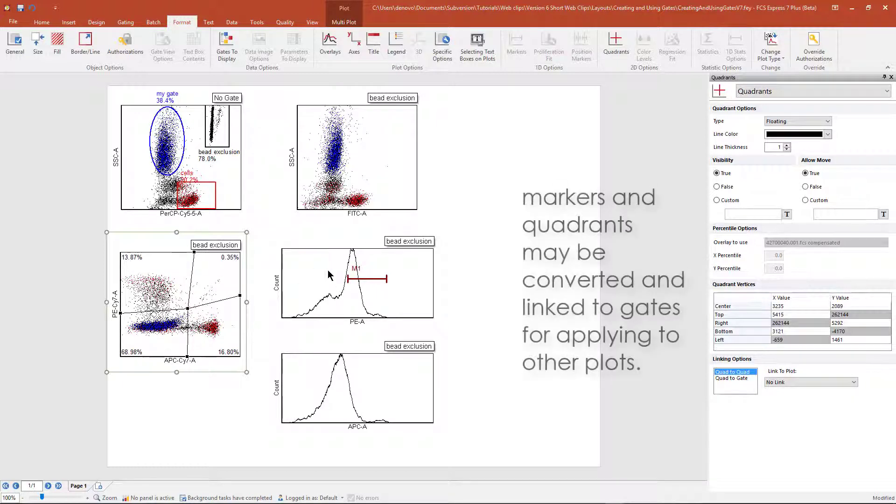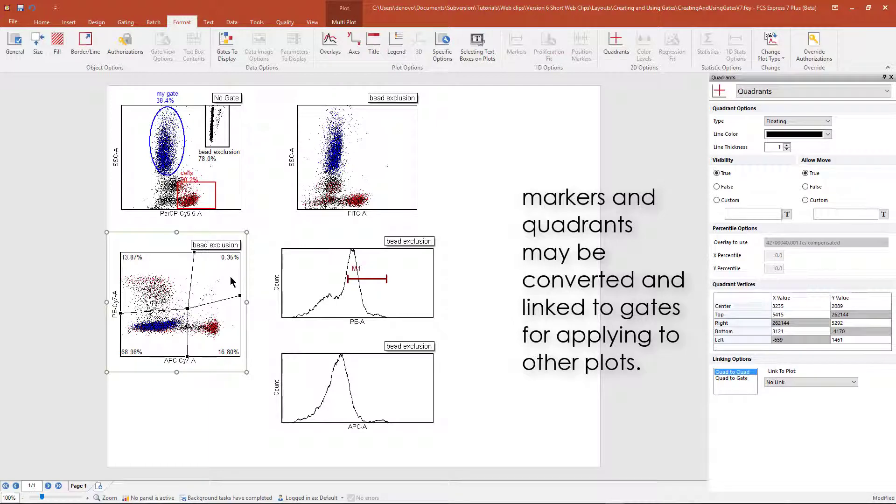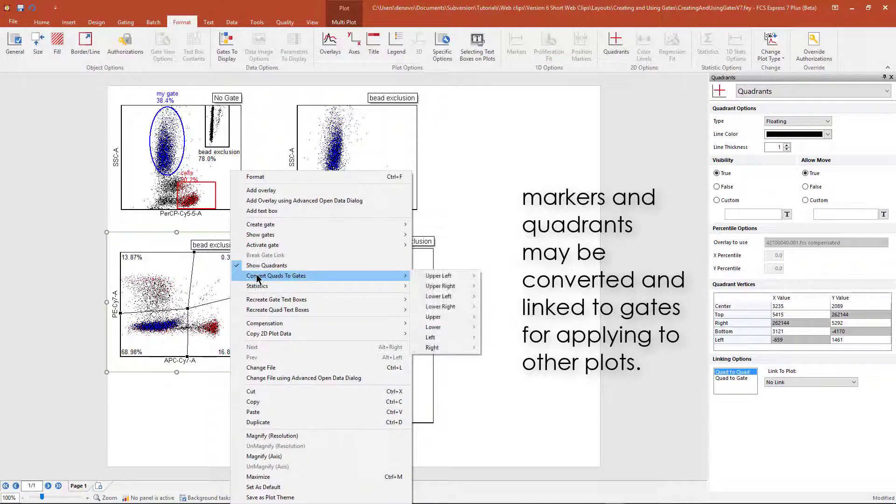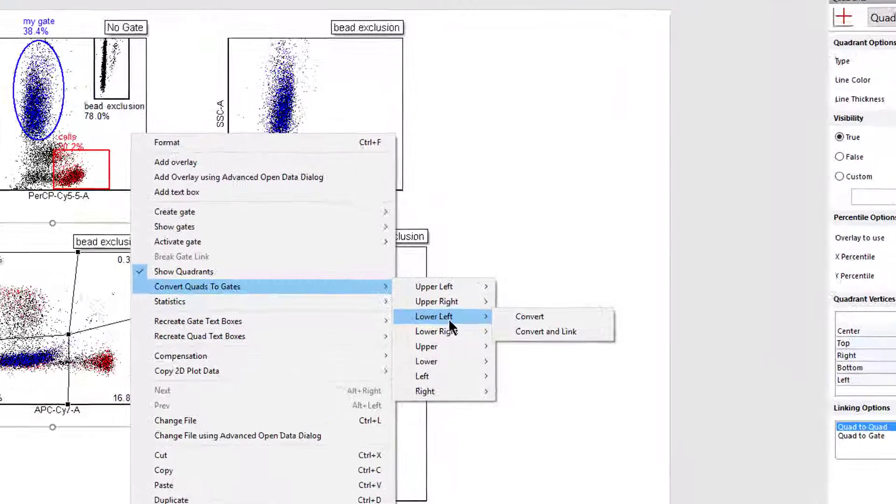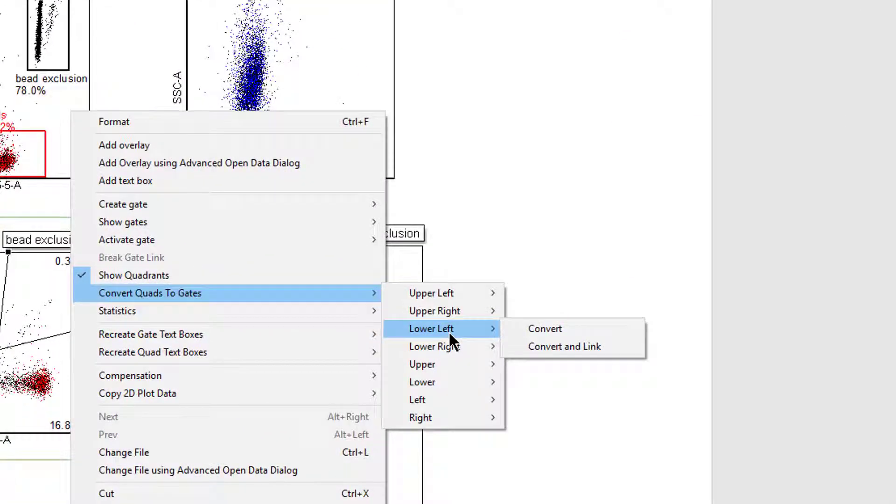Both markers and quadrants can be converted to gates simply by right-clicking on a plot. In the case of quadrants, choose the quadrant or quadrants that you wish to convert.